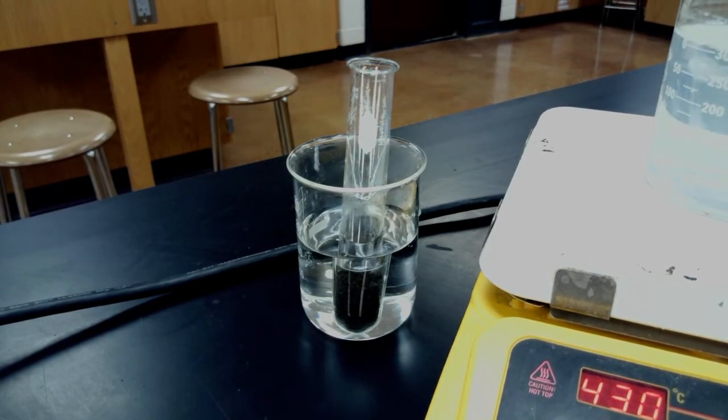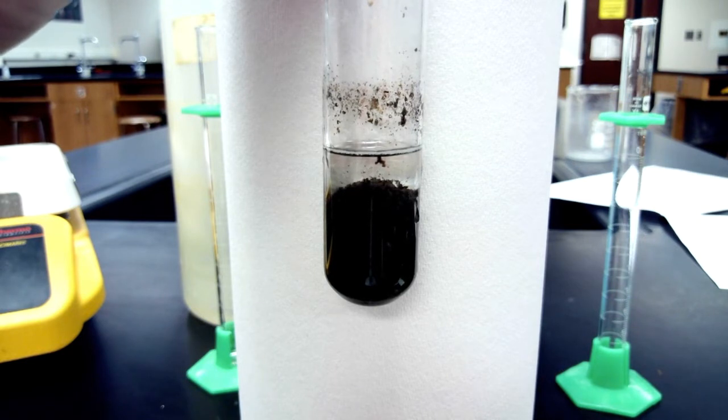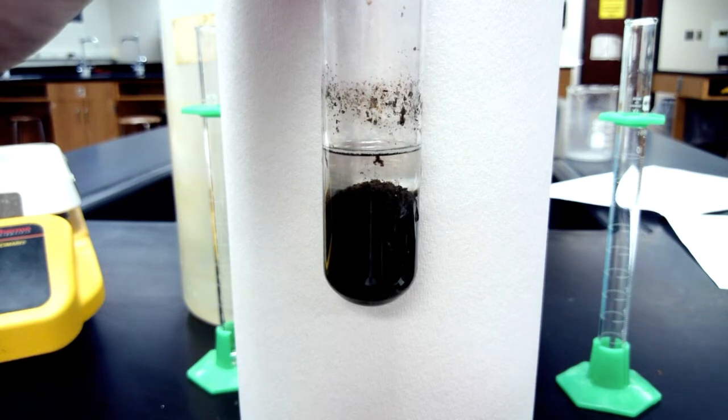And then you'll be able to see here I have a close-up of the liquid layer coming up in about a second. You can see that the solid is black and the liquid is still clear. If you let it settle, you can actually see the clear liquid layer. So that's your step 4 observation. Make sure you record the solid and the liquid.